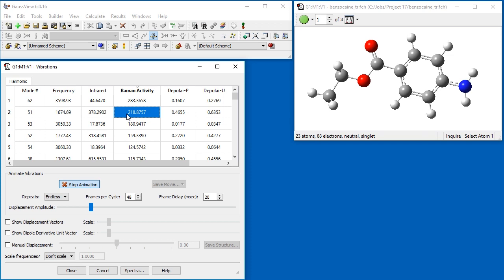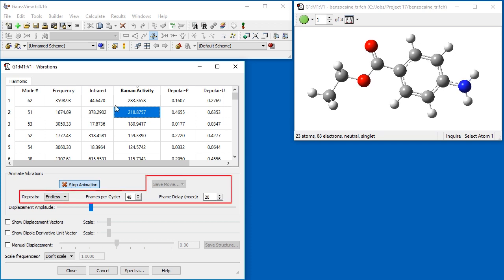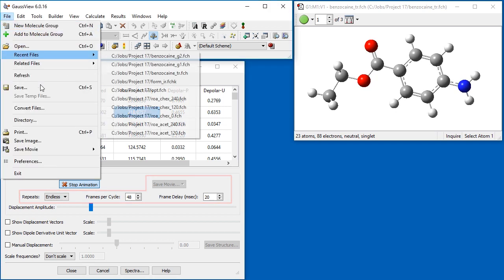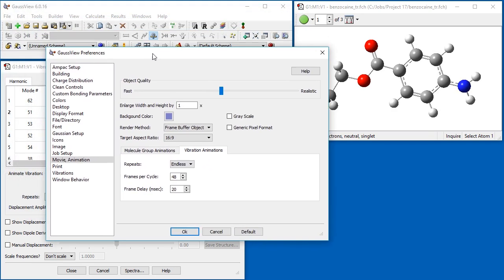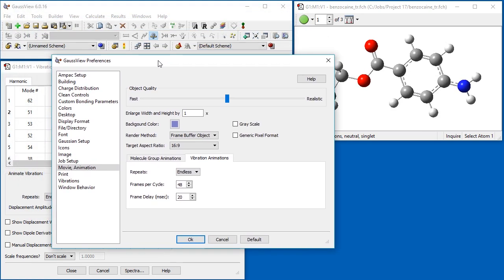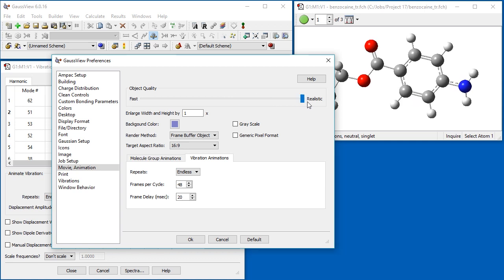The items below the Start-Stop animation button can be used to save a movie of the molecular motion. There are also additional controls available in the GaussView movie preferences. We want to create a high-quality movie, so we move the Object Quality slider all the way to Realistic.